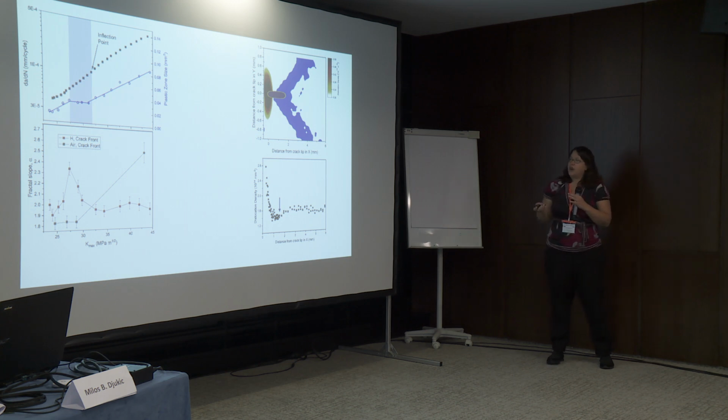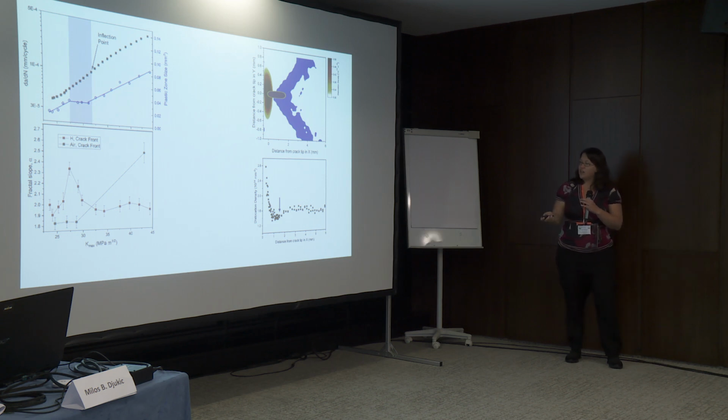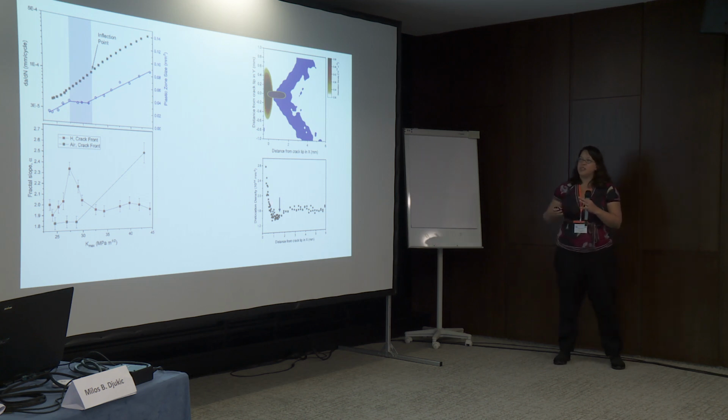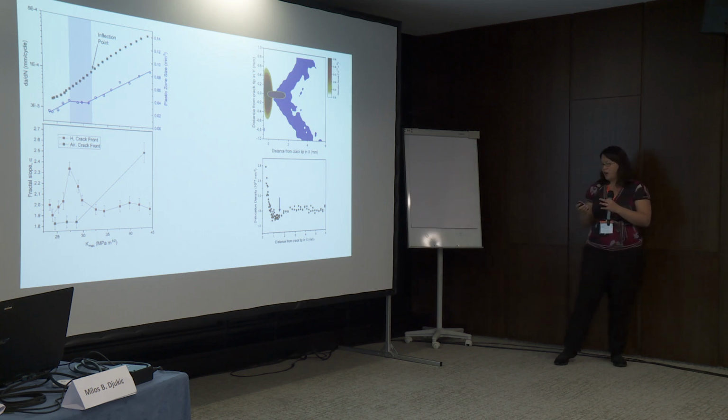And if we want to see what's going on, let's go back and look at the dislocation density as a function of region for the crack tip that's going through this area right here. And so you have the high dislocation density associated with the plastic zone. At the far field, you have this flat distribution of the dislocation density. And then right in this region here, you have the slight depression, the slight decrease in dislocation density, right where we're getting these nanovoids coalescing. And so we think what's happening here is you're getting the HELP mechanism, you're getting more dislocation activity, and that's promoting the voids, and as the voids are coalescing, that's basically devouring the dislocations that are occurring. And so you're getting this interaction that's going on.